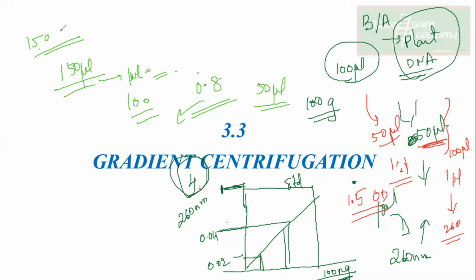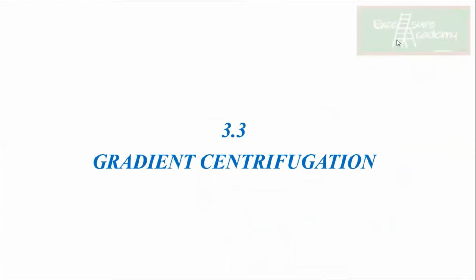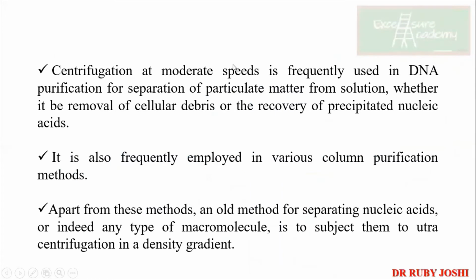So let's go ahead. So this was all about, you have got the DNA. Now there are certain techniques by which you can also purify DNA. So that is what we are going to discuss. Again, this gets a little complicated. When and why to use it comes into this. How to is okay, you can go to the lab and run it. So right now we are going to discuss centrifugation, gradient centrifugation.